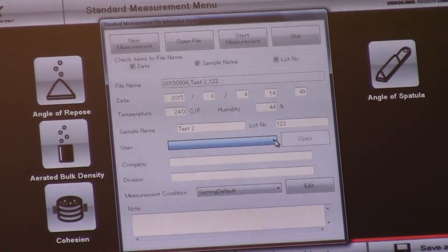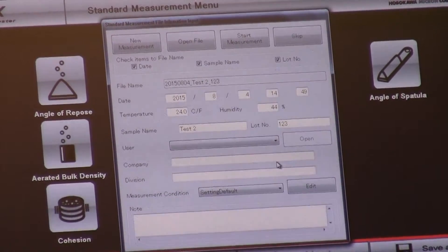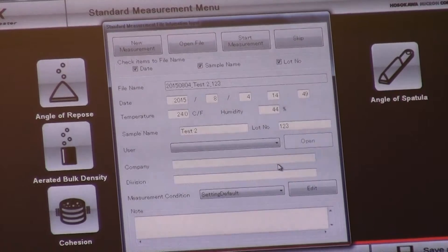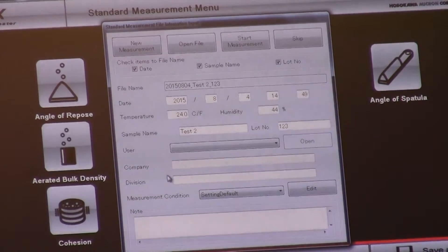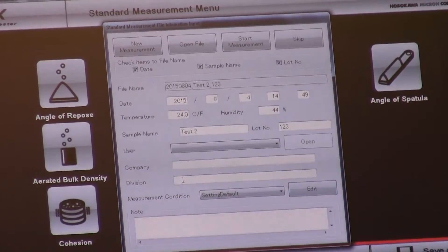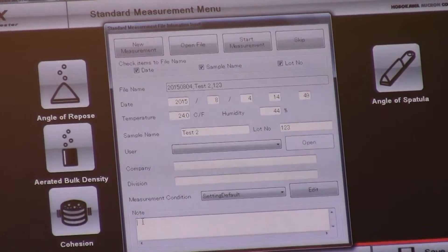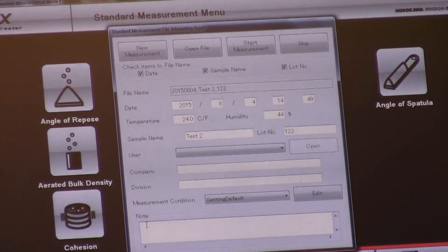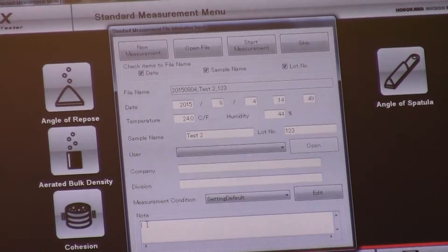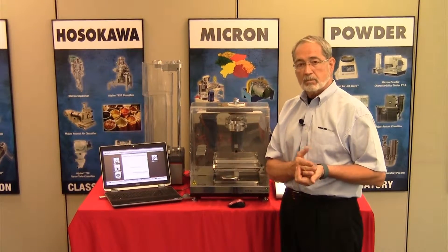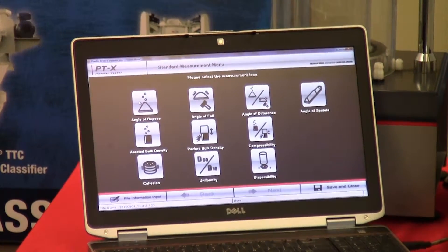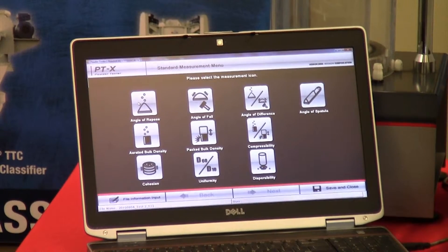In this case we don't have anyone set there. You can put the company name — in many cases I may put research and development, production, or quality control. Division — again, you can identify an individual's name from that field. Notes — you have approximately 175 characters to fill in notes. So if you're performing an analysis and you use a different screen, you want to keep a record copy of it, which then becomes a permanent part of the analysis. Once these fields have all been populated, we hit Start Measurement, which takes us back to the standard measurement menu, and we can perform any of these tests at any time.